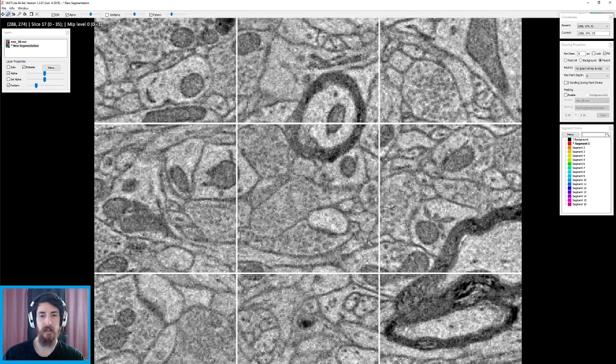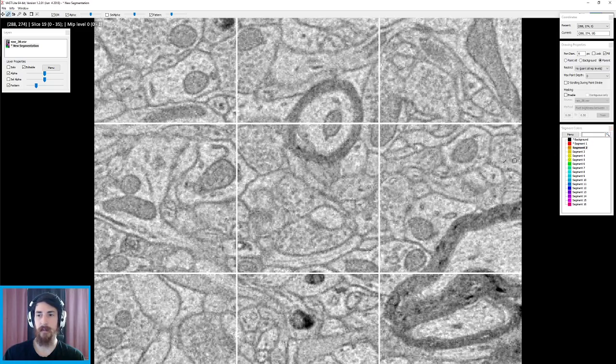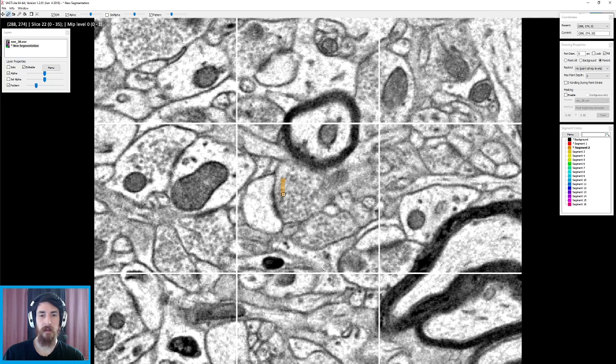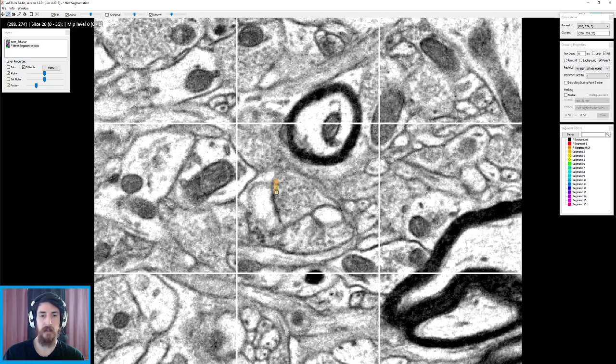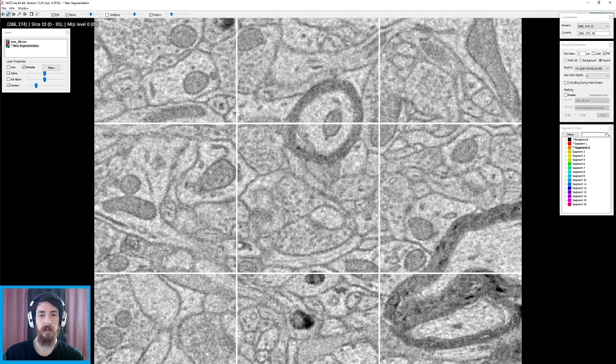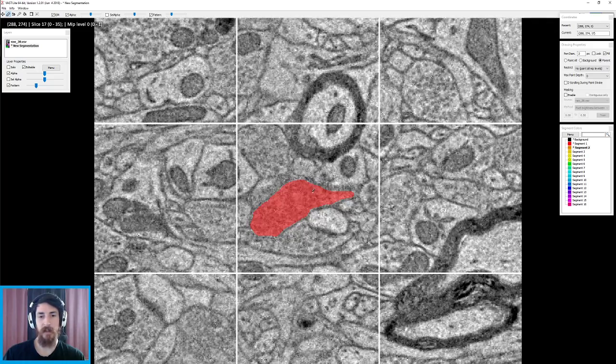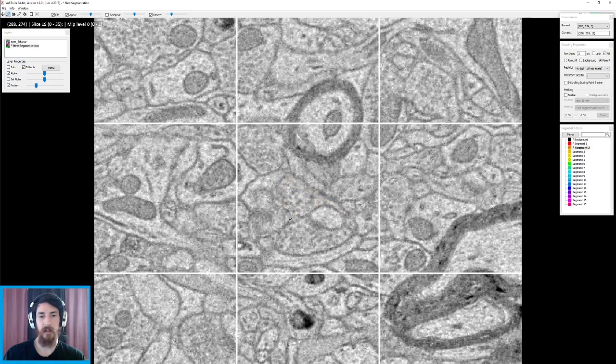Okay, so here's where it gets tricky. Let's get our segment 2 color, and let's start on this side so that we can see where they kind of meet up. Let's do this. That's going further away. Okay. This goes closer. That area is a little small, so I'm going to decrease the paintbrush size. Okay, so here we go. So it's definitely here. Alright. This gets tough right there. That's real tough. Okay, so that might be the red.